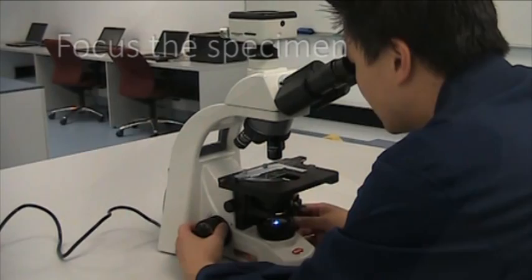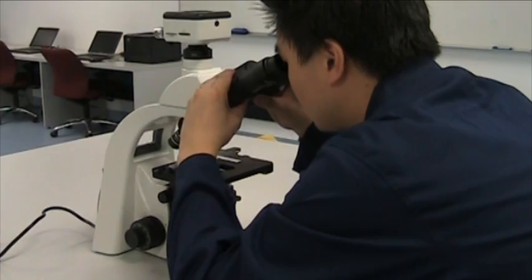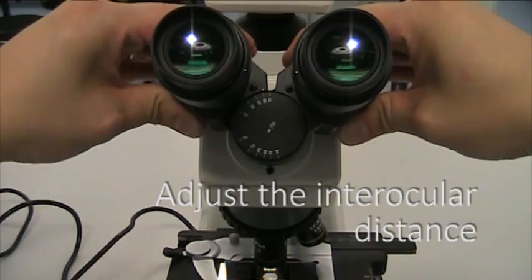Looking down the oculars, rotate the focus knobs until your specimen comes into sharp focus. It is important to use both eyes to look down the microscope. But because everybody's eyes are a different distance apart, you may need to adjust the interocular distance.